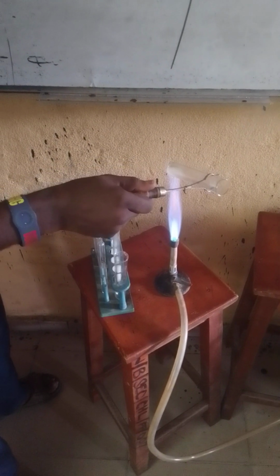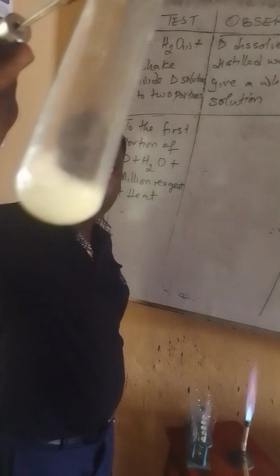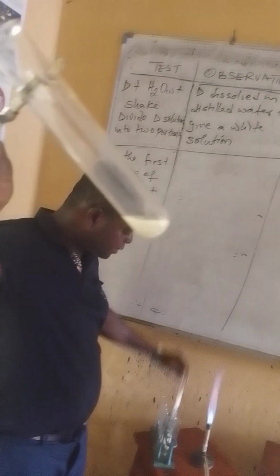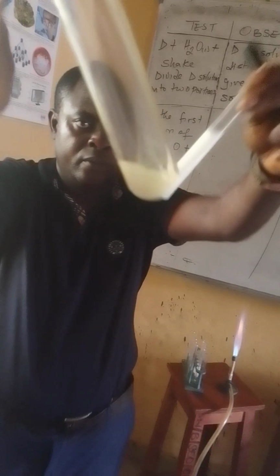You can see that it's no longer white. It's now reddish brown in color. Can you compare this with this? Can you see the difference? This is reddish brown color.